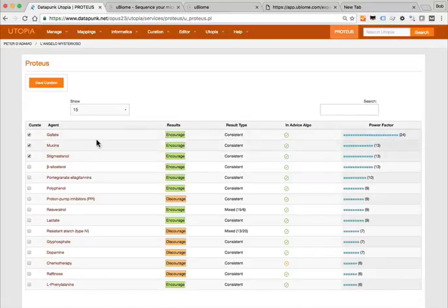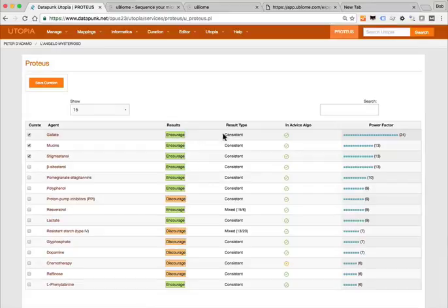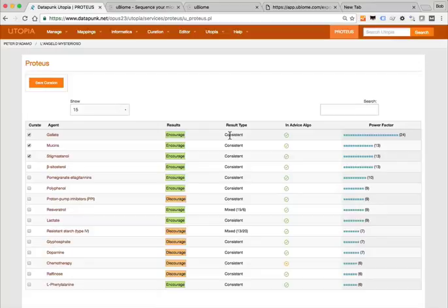Here's the result. For instance, gallate is something that might be really important to encourage, and any number of different natural products and a variety of plants contain gallates. The result type is 'consistent,' meaning virtually every strain we looked at had no contraindications — no strains where this worked against what we were desirous of having a beneficial effect on. Sometimes they'll be mixed — you wind up with evidence suggesting something should be discouraged and additional evidence suggesting for a different bacteria that it should be encouraged — giving essentially a mixed result.